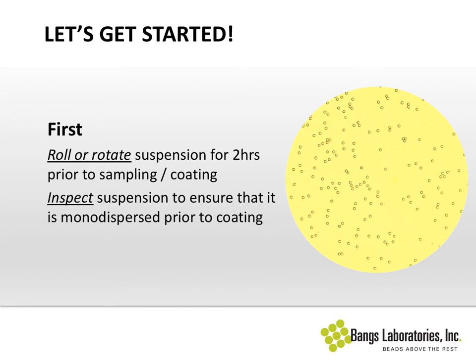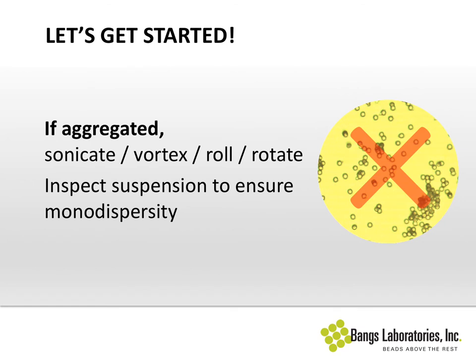Our standard magnification for viewing under the microscope is going to be 400x — so like a 10x objective and 40x magnification. If you are first sampling from the bulk suspension and you find that the material is aggregated, you should use some sort of physical method to break up aggregates and return it to a monodispersed state. Typically we would sonicate it, vortex it, roll, and rotate. The idea is that sonication will blast apart the aggregates and rotation will redistribute surfactant and keep particles from clinging to one another. Then again, inspect the suspension to ensure that it's monodispersed.